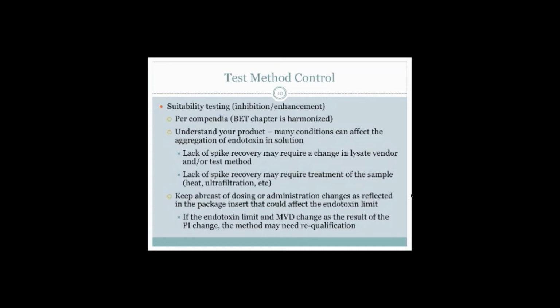While all the lysates do the same thing, they detect endotoxin, and the standard here is to detect endotoxin in water, all of the lysates are really different. They're formulated differently. They have different levels of divalent cations. They have different levels of sodium. They have different levels of buffering. So the lysate from one manufacturer, while it does the same thing in terms of detecting endotoxin in water, in terms of formulation may not be equivalent to the lysate from another manufacturer. So if you're having trouble recovering your endotoxin with your favorite lysate manufacturer, please think about changing the vendor or think about changing the sample.